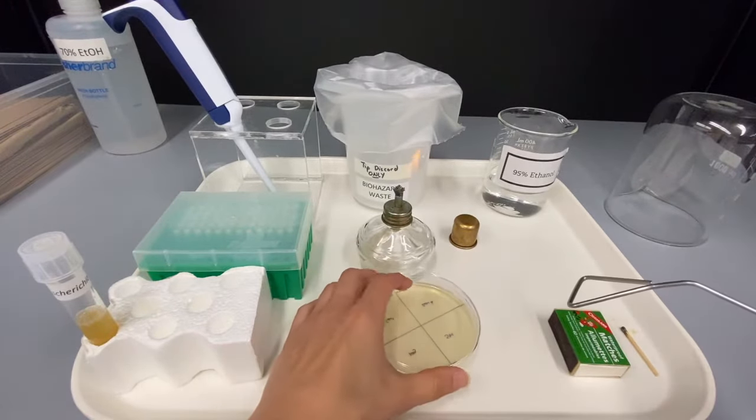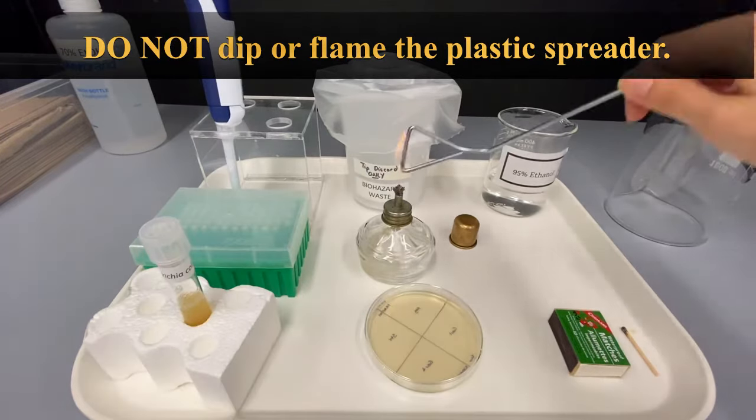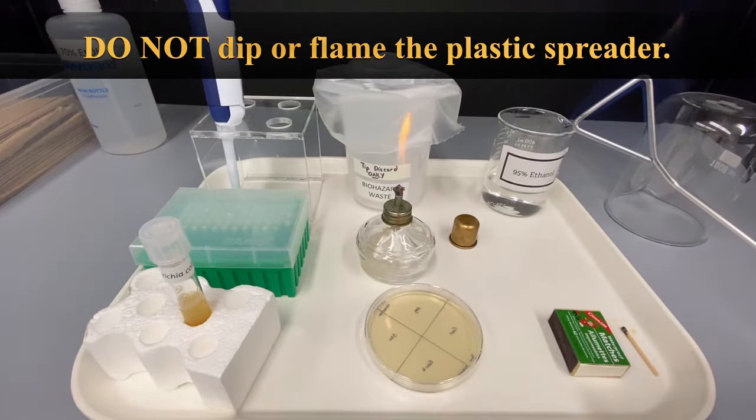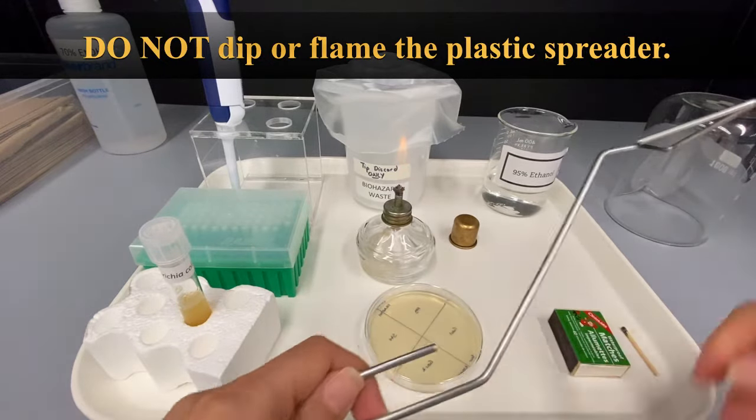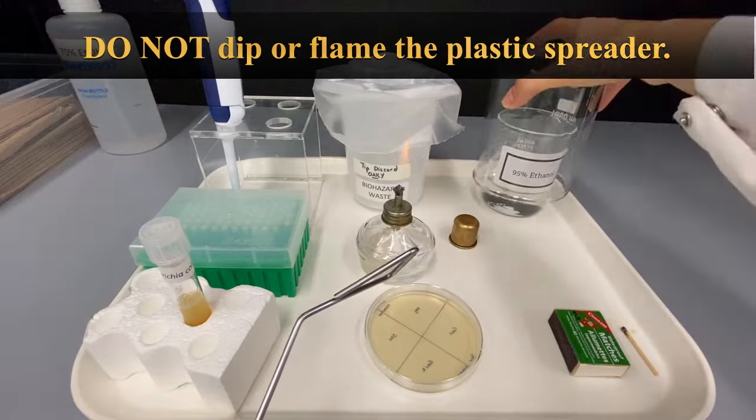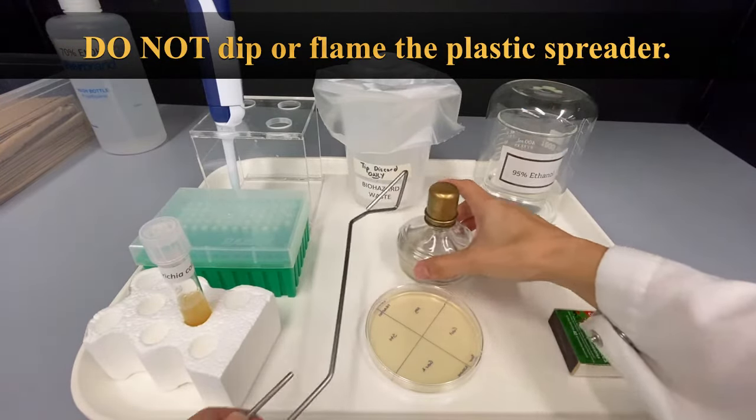Once you are done spreading your bacteria, dip the metal spreader into the 95% ethanol, pass it through the flame and wait for the ethanol to burn off. Cover the 95% ethanol and extinguish the flame by covering it with a cap. Return the spreader to the tray.